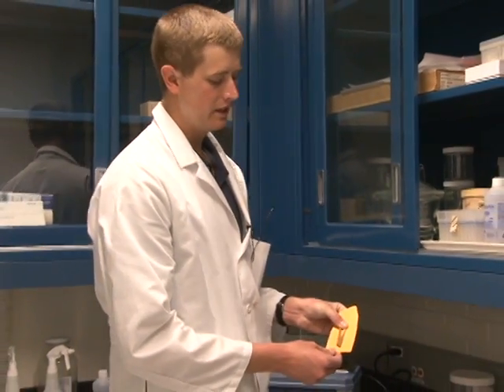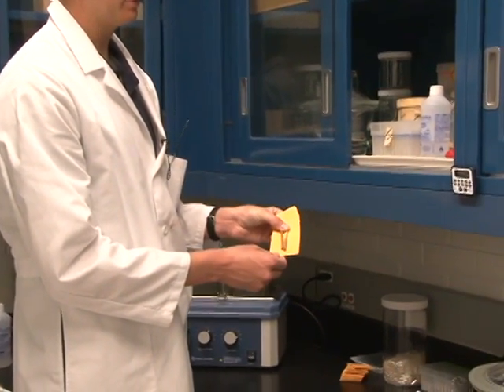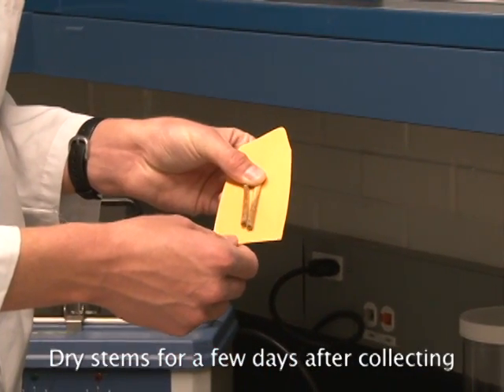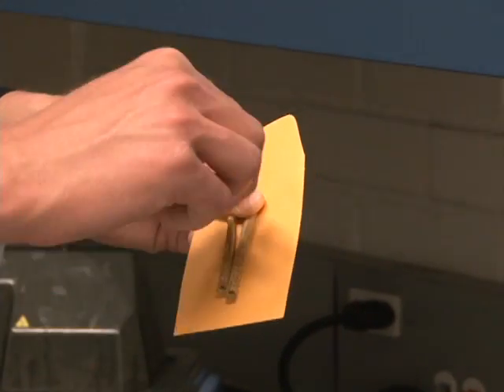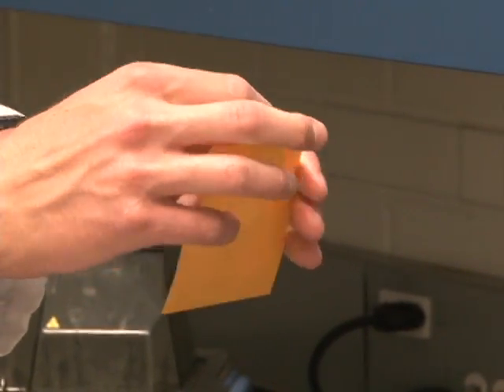For short-term storage, a simple thing that you can do is take some plants that have been infected with rust. Here is a cutting of a couple of stems that have been infected with stem rust. They've been placed on this table for a few days to allow the plants to dry. Once the plants have dried, you can simply take the stems and place them in an envelope.